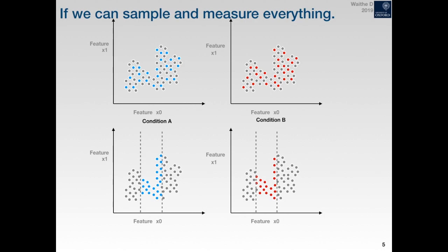So I'm interested in developing tools that allow us to bring a more quantitative element to this selection of what we're imaging in, for example, super resolution or in time series, where we have less time to actually do the experiment. So you do a coarse pre-imaging phase, and then based on what you see there, you can then choose which cells you want in a justified way, okay? And then switch to a modality which is more demanding and takes more time. Make sense?